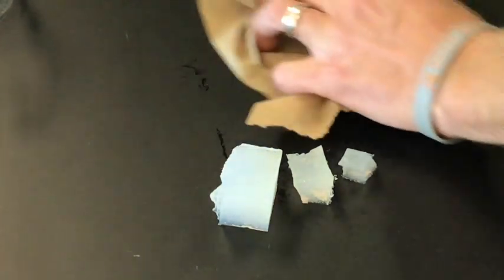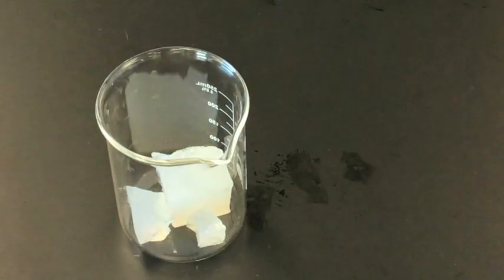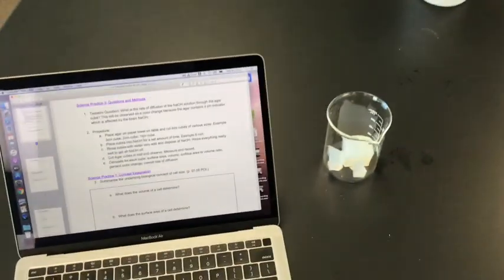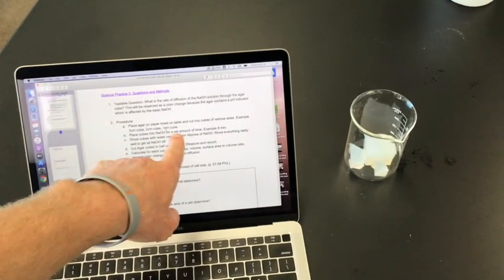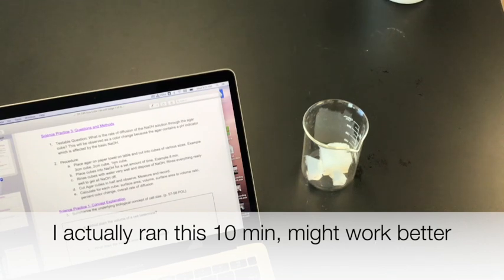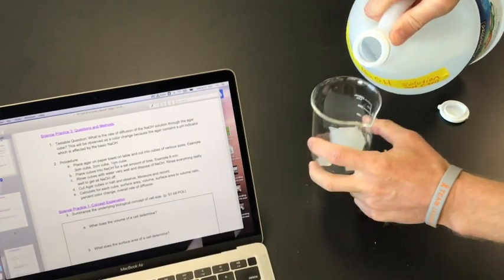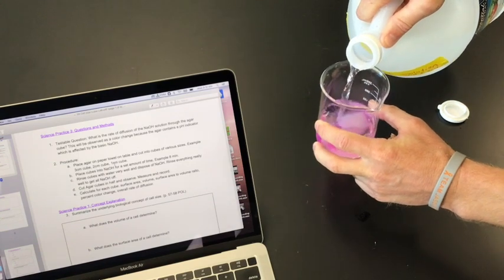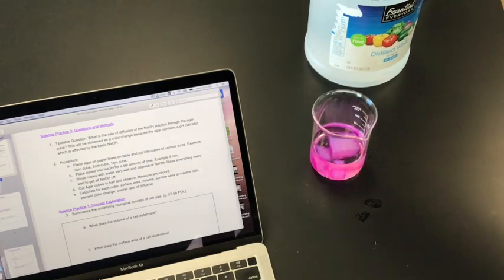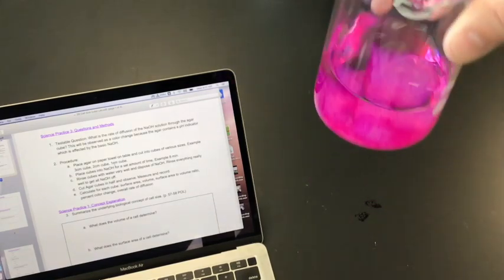...sodium hydroxide. Before I do that, I'm probably gonna clean up a little bit. I'm just gonna wipe this up and then maybe rinse my hands off, get that agar off of them. Okay, so I'm gonna put the cubes in a beaker, zoom out a little bit. And then the next part of my procedure is to place the cubes in sodium hydroxide for a set amount of time. Running this lab for a few years, it seems to work pretty well. I'm gonna take... I have prepared some sodium hydroxide solution for you. I'm just gonna top it off so the cubes are under. This says vinegar but I also labeled it sodium hydroxide on the container there.